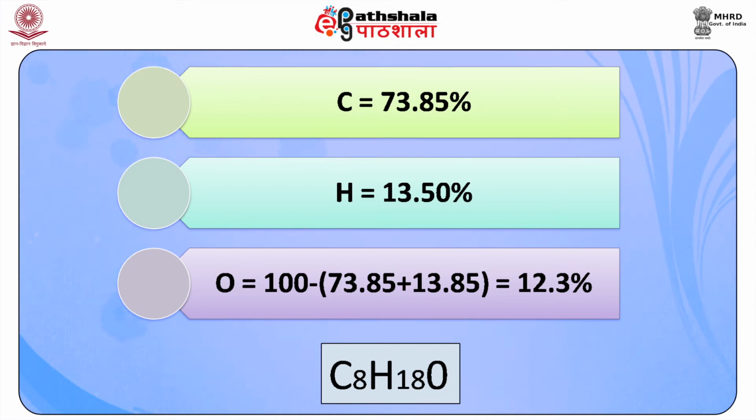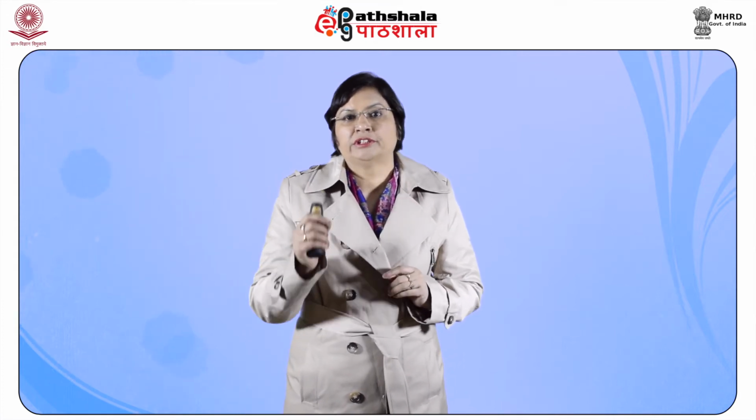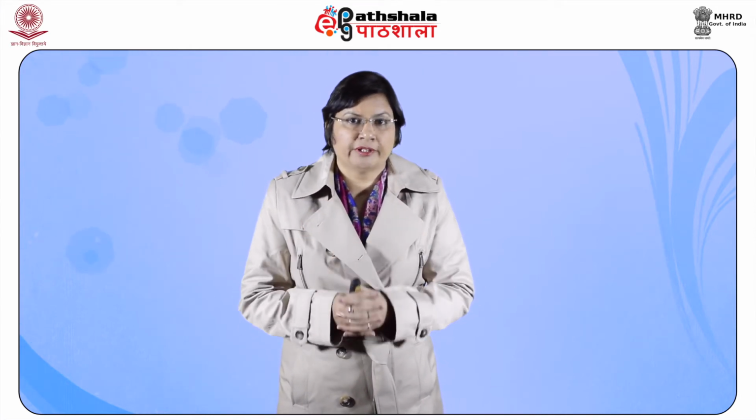We get that it is C8H18O. Since the compound is transparent above 210 mu in the UV region, it shows the absence of carbonyl group, nitrogen containing group and conjugation, etc. So, this is the important information we can derive from the UV data.